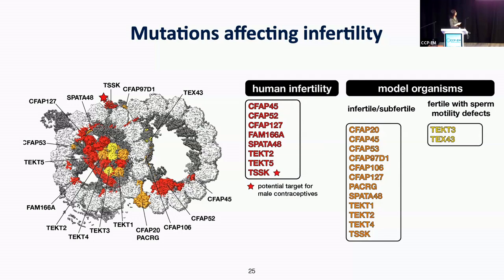But what you can see is that a lot of these other proteins, all the gray ones, were not recognized yet as part of the assembly. So we feel that we are providing the community a very good resource, because we tell them, this protein, this is where they are, and this is what their interaction networks are. And that's something that is very important for the fertility field.